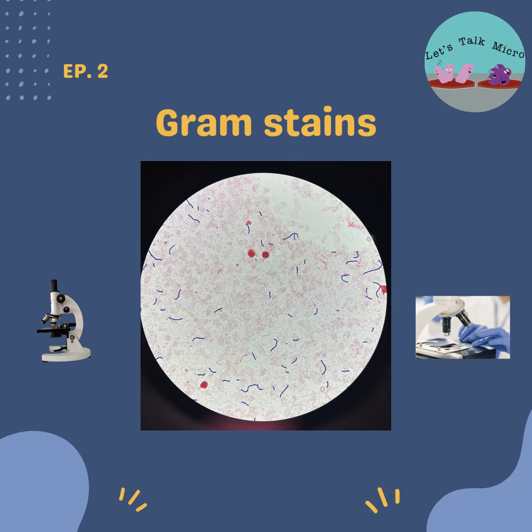Granted, there are some huge facilities out there that produce so many gram stains that it's definitely easier to put them all at once in an automated stainer. But you have to make sure that you know what you're looking at. Instruments can malfunction, right? The same way that we can over or under decolorize a slide, your instrument can malfunction. You might run out of reagents, and your end product might be the wrong color of the stain. Sometimes I have seen gram positive cocci that look pink. So I'm not a fan. I like my good manual technique.